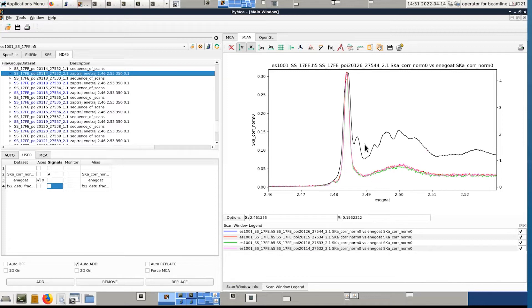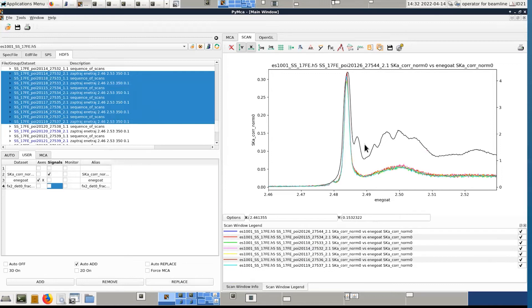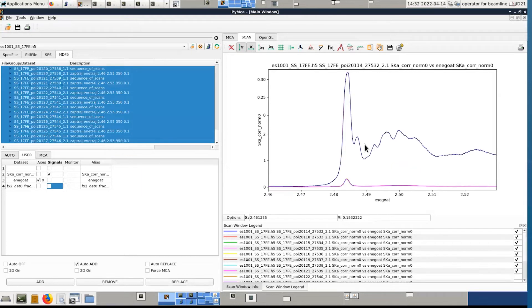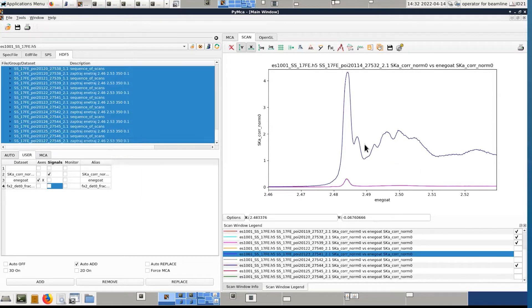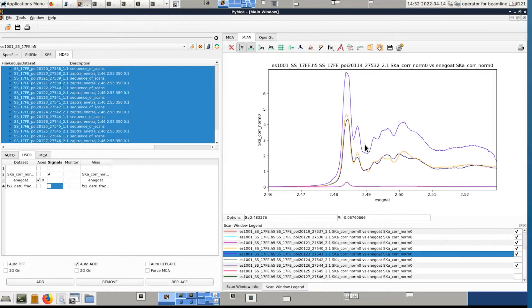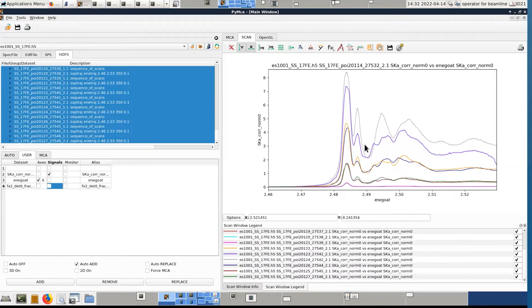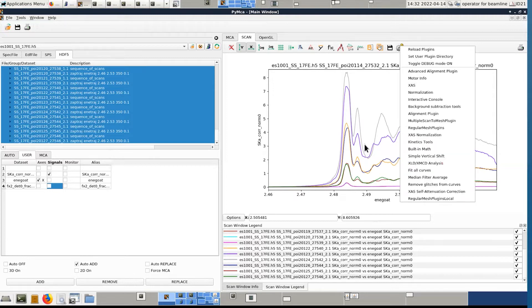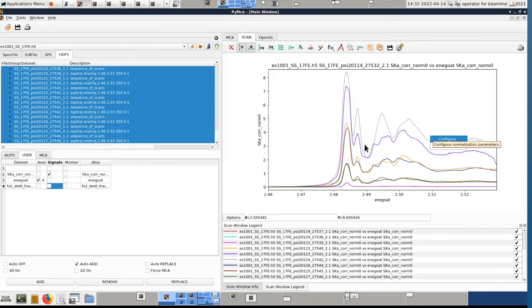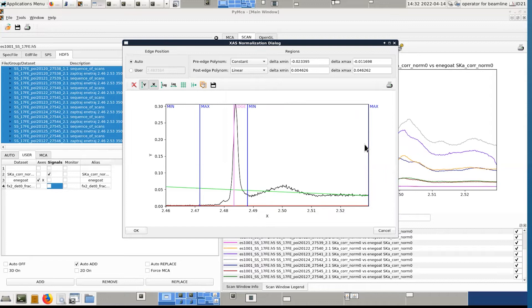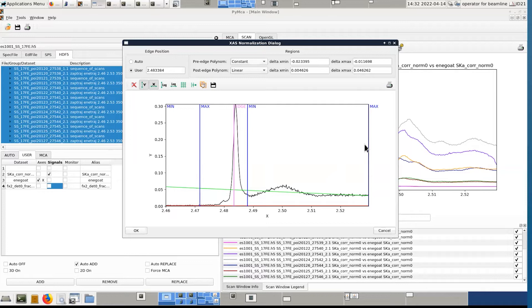Another way to do that is to somehow normalize. So I should add very concentrated ones. Normalize the spectrum. So keep in mind that if you have deselected them, this is recorded. So if you want to see them again, you have to reselect them from here. So the XANES spectra, they can be normalized, such as it is easier to compare them independently of the sulfur concentration. You have two options for that. I would say a high quality dedicated XANES normalization option in which you are going to configure basically three aspects.